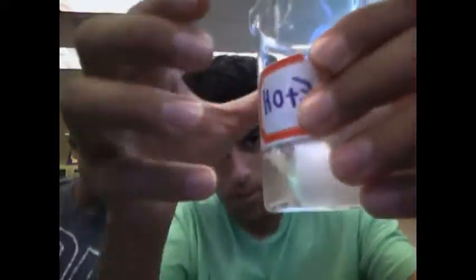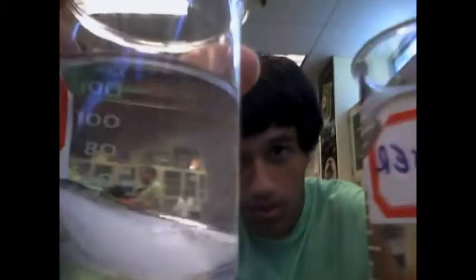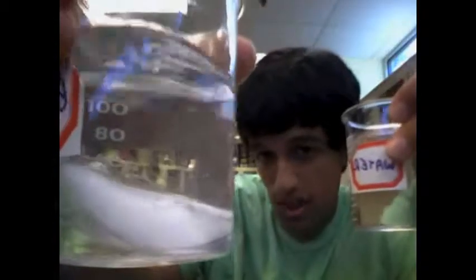Now you can see the bubbles coming off. Notice how the ice sinks to the bottom of the ethanol, denser than ethanol. In water, however, the ice floats. Water has a density of 1.00, the specific density you measure compared to water. The reason the ice floats in the water is that the ice is less dense.